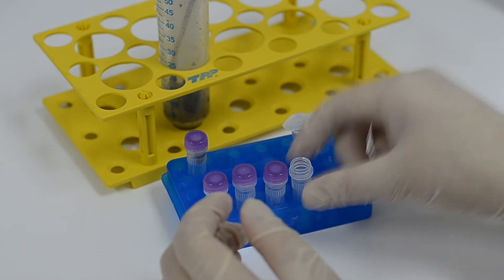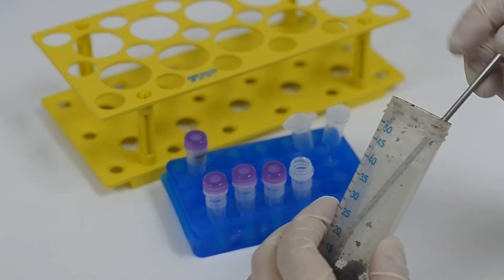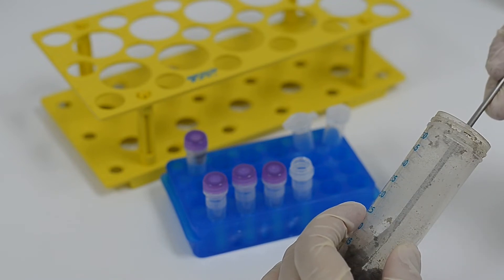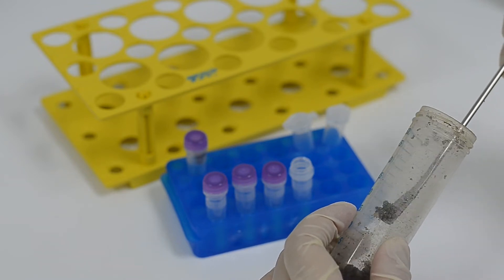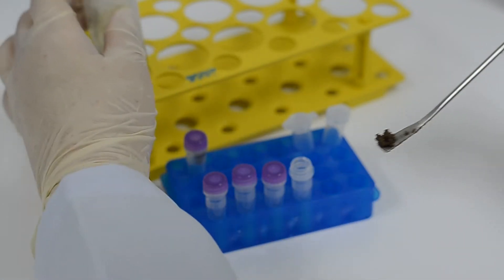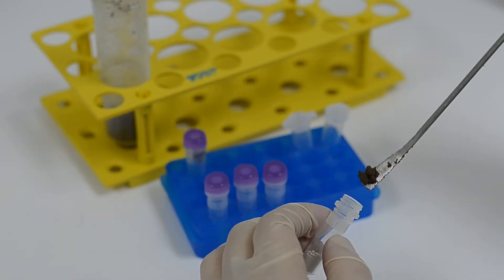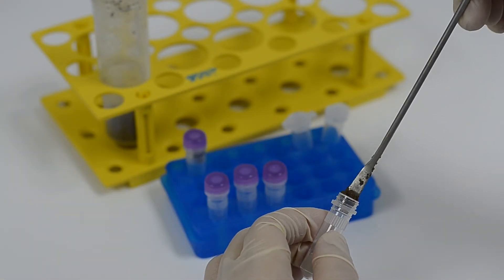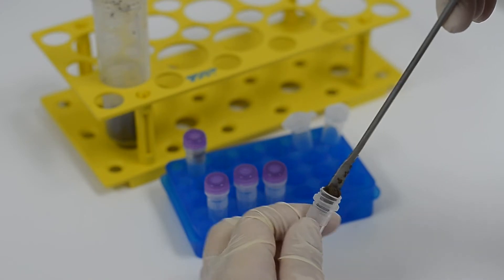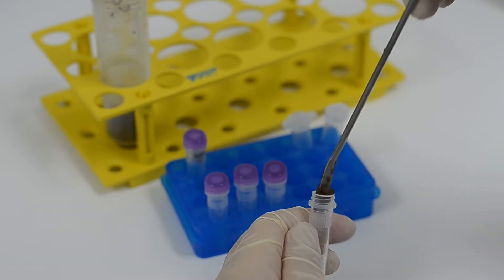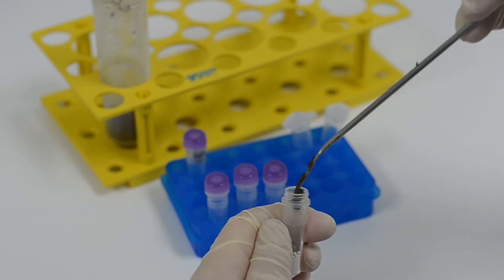To begin sample processing, add 100 to 500mg of soil sample into a lysing matrix E tube. Ensure that there are one-third to one-quarter of empty space remaining in the tube.